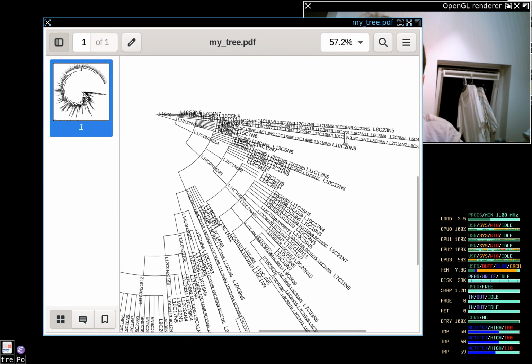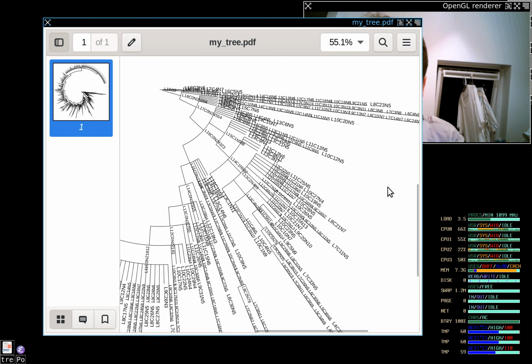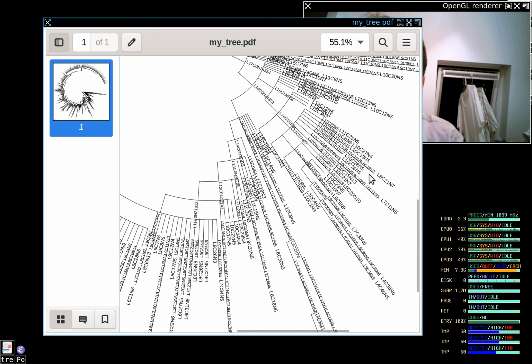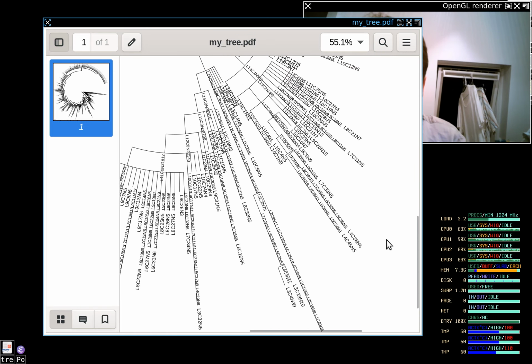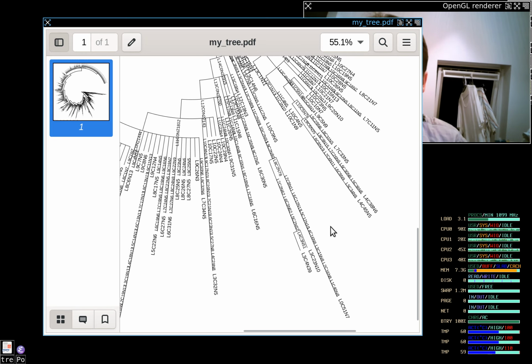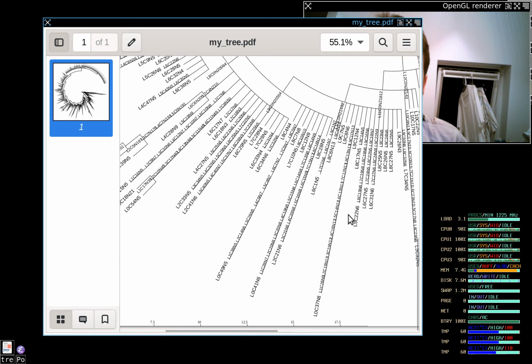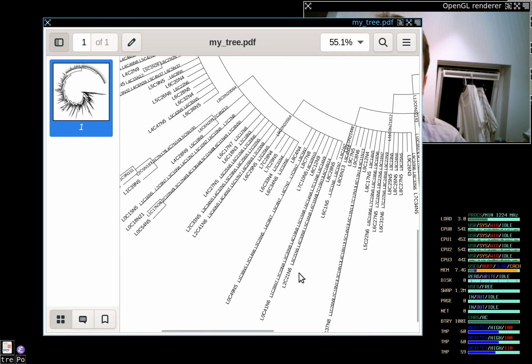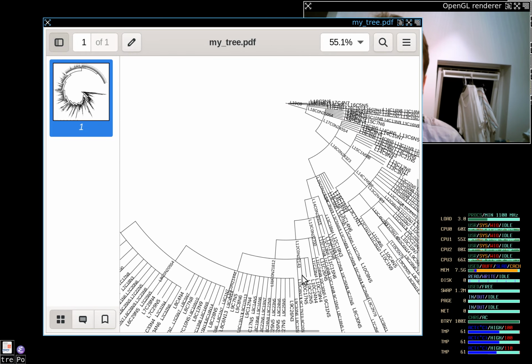And here, somewhere we should have the fan between the little thing and the big thing here. Just thinking about it, this here should probably be the second part that we have seen on the shore here. It starts at the cluster layer 4, which is basically the second island, if you want to, yeah. But never mind. Okay. So these are basically all your trees, and what you want to know is that on the outside these are the most dense clusters. The more you get on the inside, the less dense you get, the earlier you're in evolution. That's the idea how this should work here.